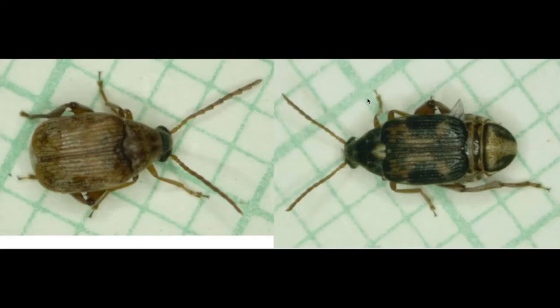In this pair of images, the small squares are a millimeter scale. Here we have pictures of male and female bean beetles, Callus abrucus maculatus. The male on the left is brownish in color, and the female on the right is more black in color, but that's not a good characteristic for telling the sexes apart.